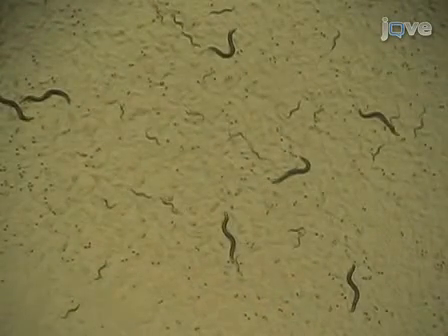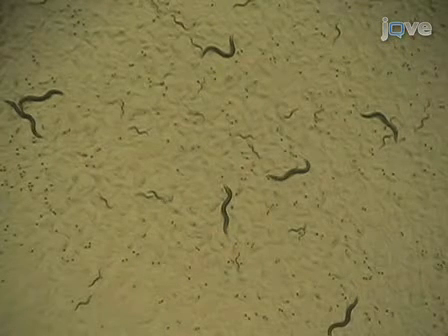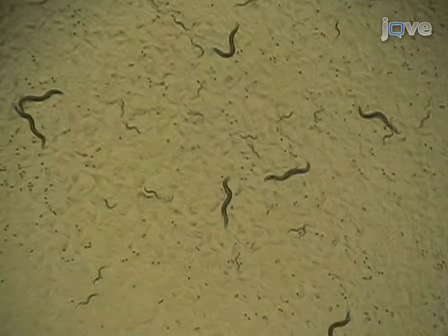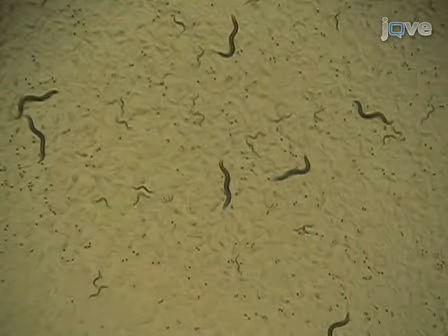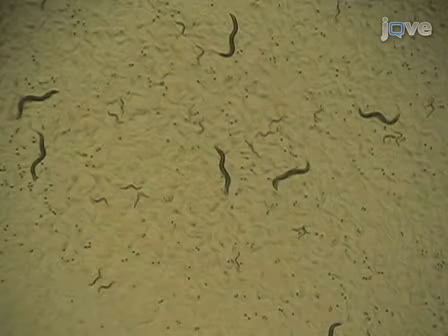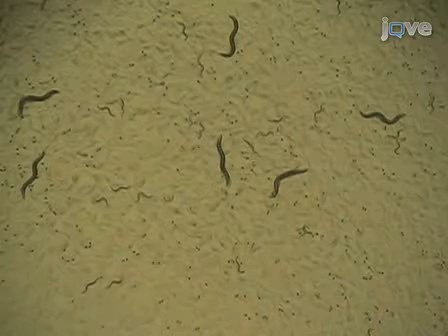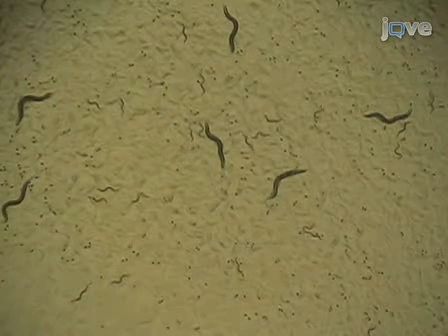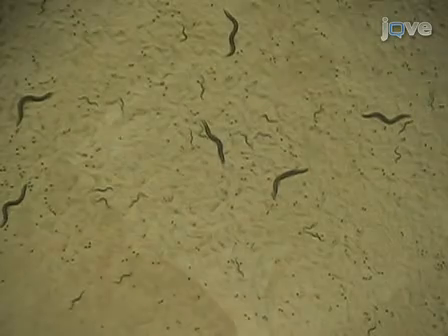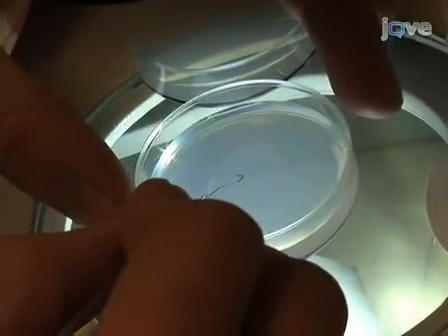If a significant number of larvae are present, this usually indicates that the worms were transferred to the AMP-FUDR plates as young adults instead of as L4s. Young adults can lay eggs before the FUDR takes effect and occasionally larvae escape the effects of the FUDR and grow into adults. These larvae will confound the experiment. In this situation, transfer the adult worms to fresh plates and discard the old plates containing the larvae.